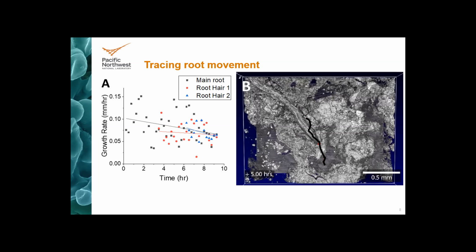Great. And is there a need for specific software to extract the roots, or the images, or will it be straightforward and right away you can just see? This instrument comes with its own software for operation, and that's what generated the 3D images. But you can export it in a number of pretty common formats. So if you already have techniques to work with 3D images, then I'm sure that we can get the data from this instrument into a format that you can use.